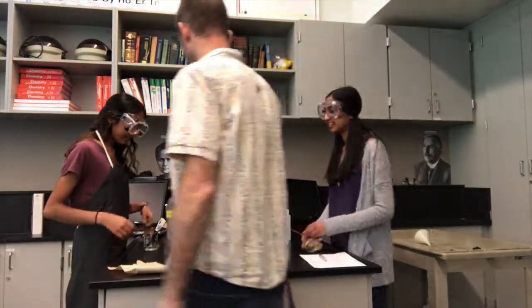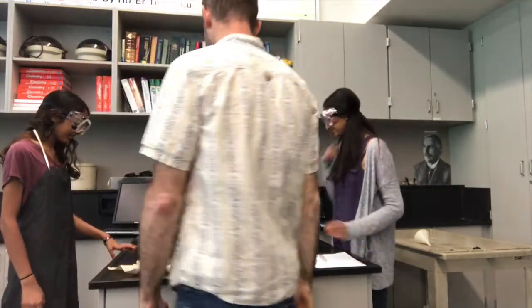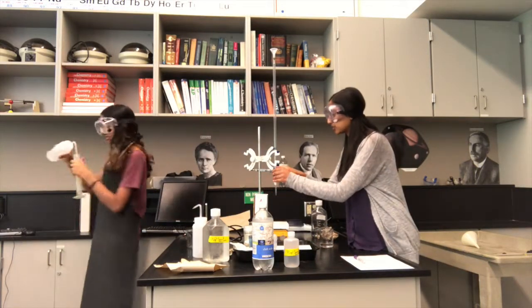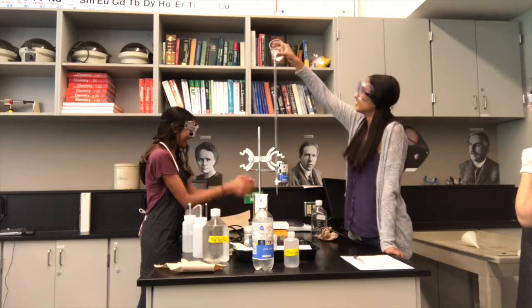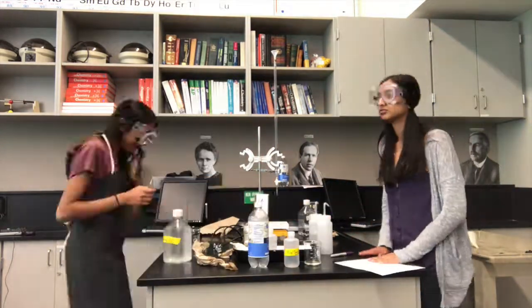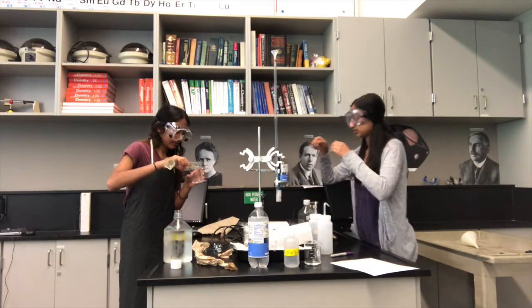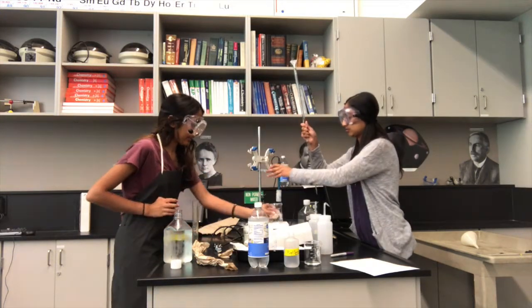At this point in the lab, something undoubtedly would have gone wrong, so ask Karinji for help. Make sure the burette is closed before adding solution. Pour the measured amount of carbonic acid into the burette. Measure out 100 ml of seawater in a graduated cylinder. Pour the seawater into the beaker that will be used for the titration, and place it on the hot plate.